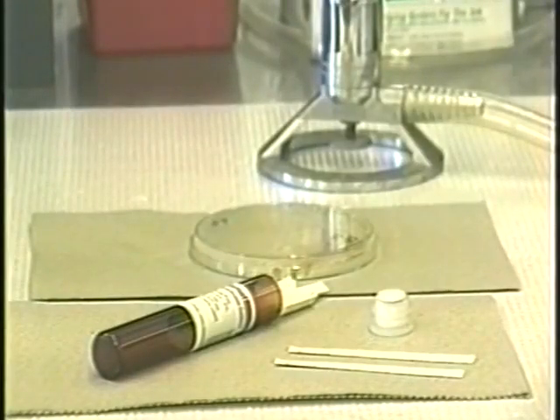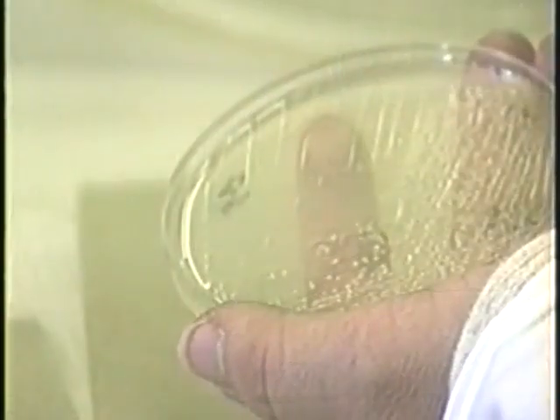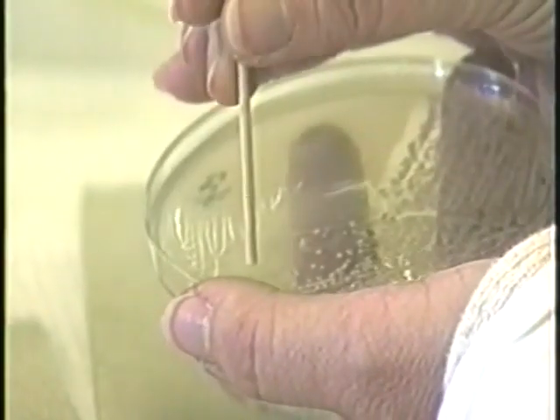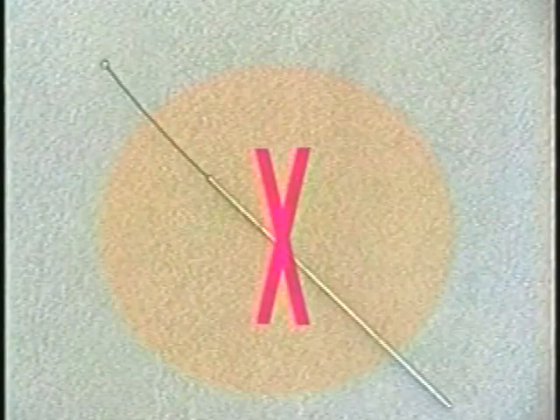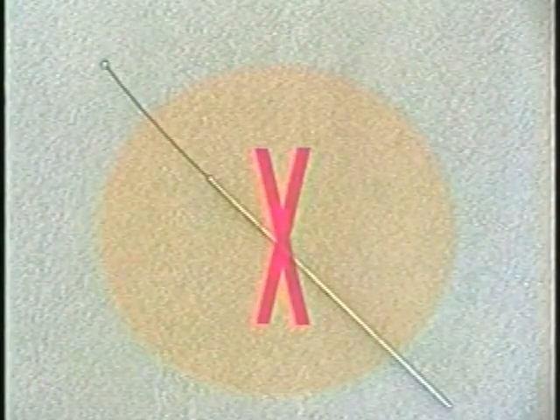Oxidase test strips are commercially available, and the procedure simply involves smearing bacteria from a single colony onto the shaded area of the test strip and looking for a purple color change within 20 seconds. Use either a sterile toothpick or a plastic loop because iron loops can give a false positive reaction.